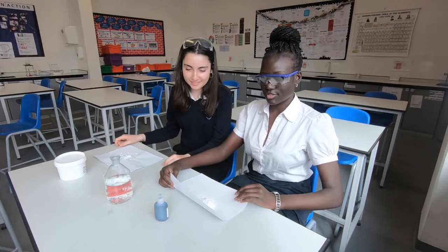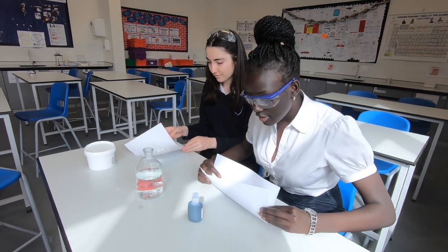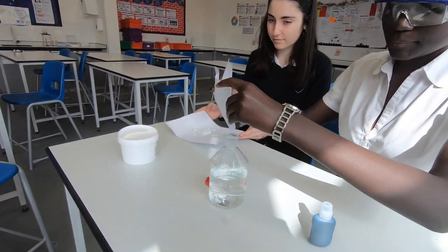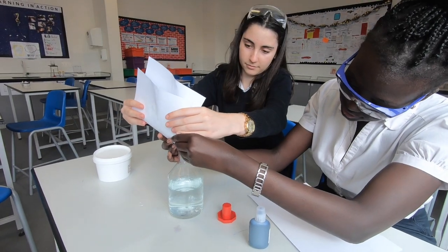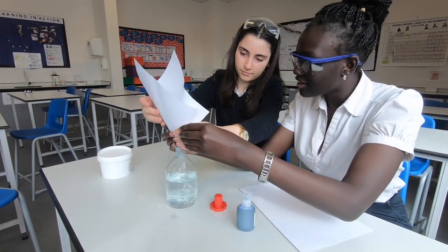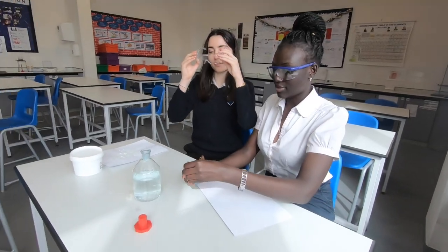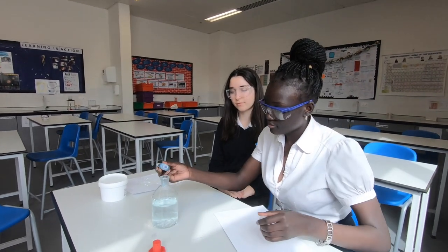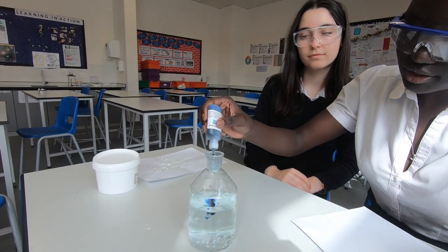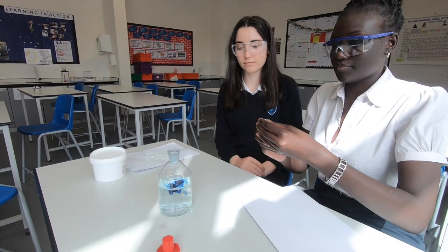Now we're going to demonstrate the oscillating reaction. First we're going to add glucose to water and then some potassium hydroxide. Looks good. Now we're going to add a few drops of methylene blue. Let's stop there and see what happens.